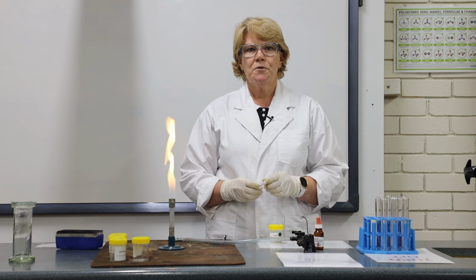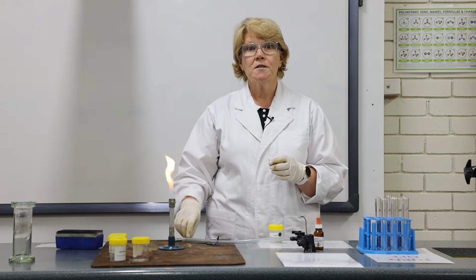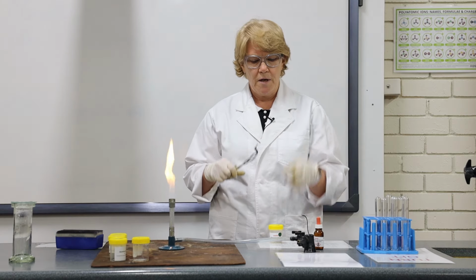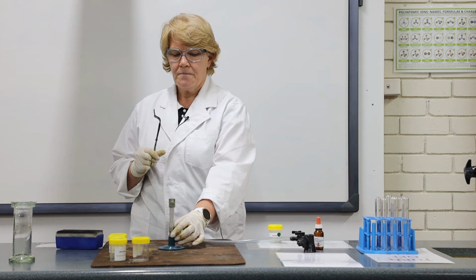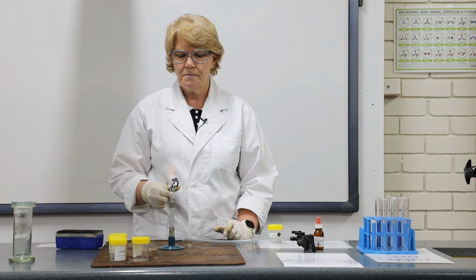Let's look at the reaction between magnesium and oxygen. This is not as fast as the reaction between sodium and oxygen because magnesium's not as reactive. I have my piece of magnesium ribbon and my Bunsen burner. I'm going to place the magnesium in the hottest part of the flame and let's see what happens.